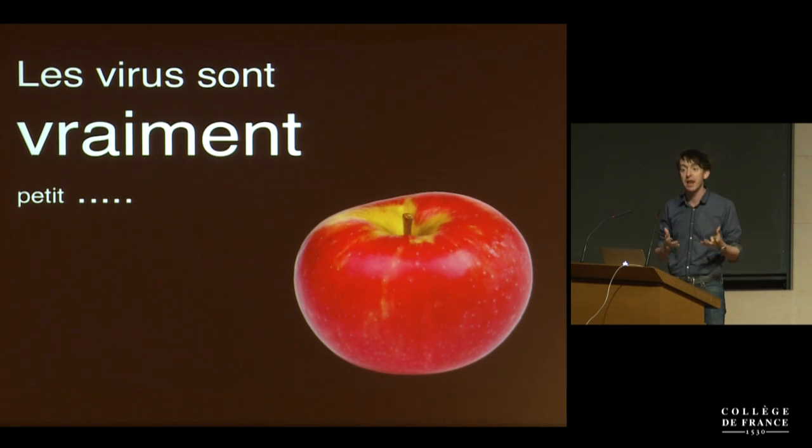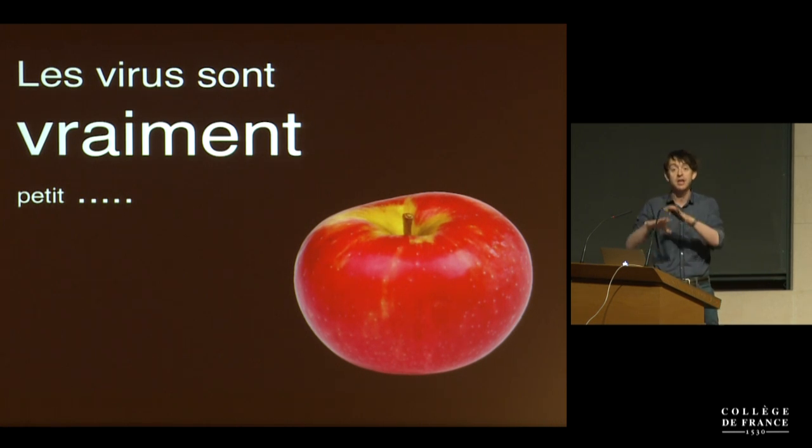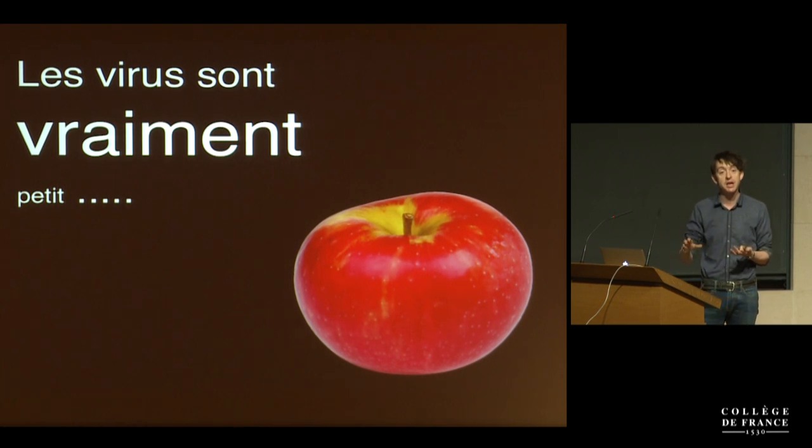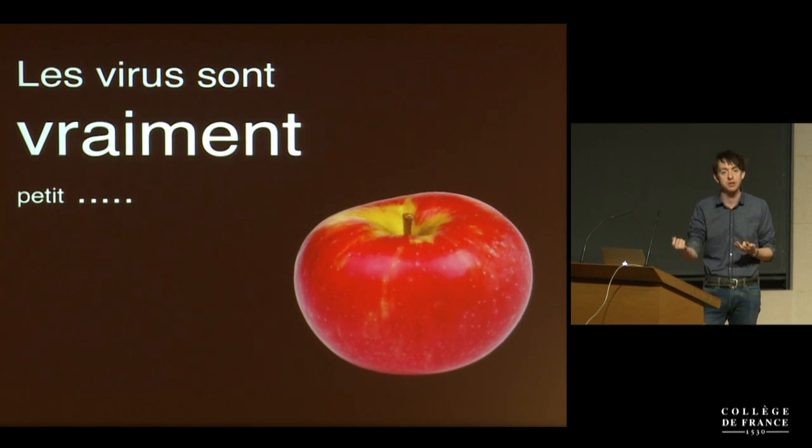Viruses exist at a molecular scale, and this presents a practical problem when applying microscopy. If we consider a 100 nanometer virus particle that's decorated with fluorophores, when viewed down a microscope, it appears as a spot to our eye or to the detector of around 200 to 500 nanometers across. So that spot doesn't well represent the true structure.